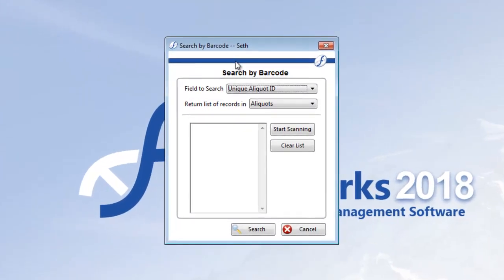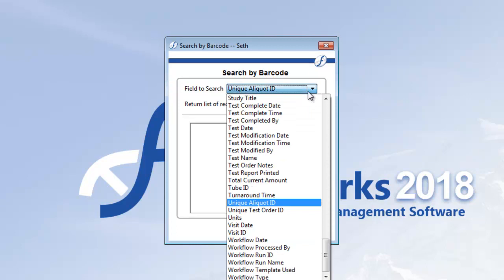It's a fairly simple form. First, determine the field you'll be searching on. In other words, what is the field that corresponds to the barcode values you'll be scanning? Since I've got a bunch of vials that have aliquot ID labels on them, I'll select unique aliquot ID.